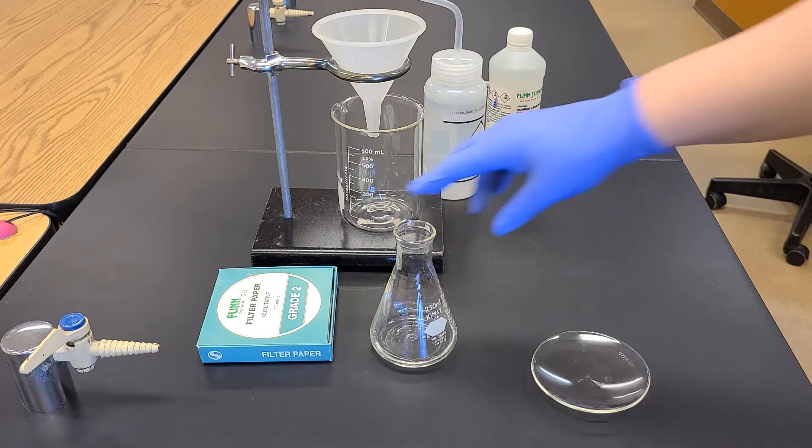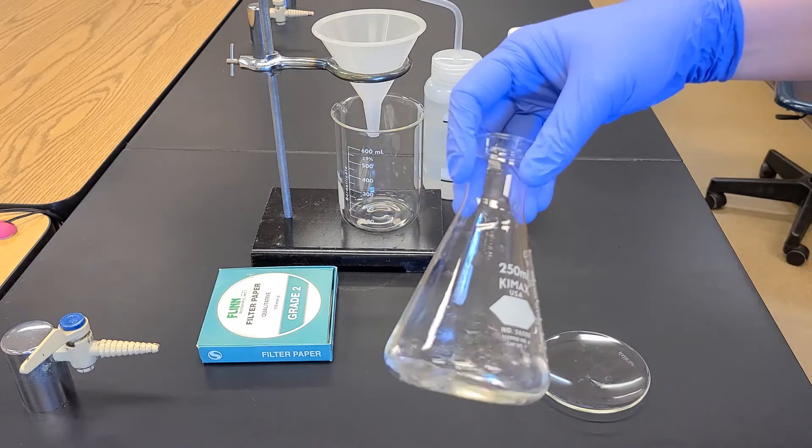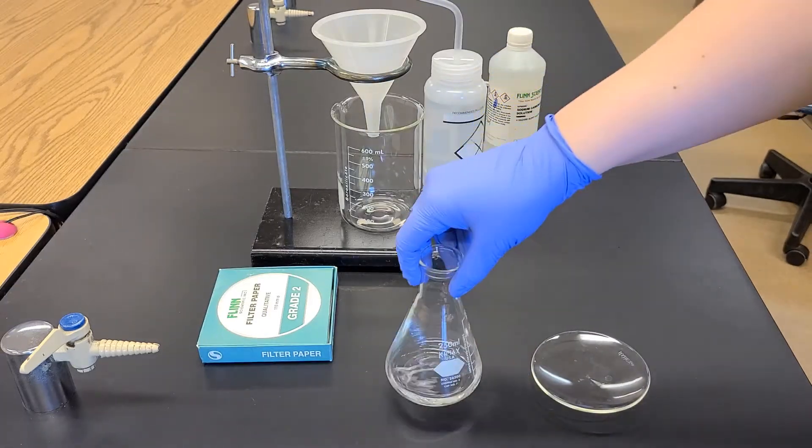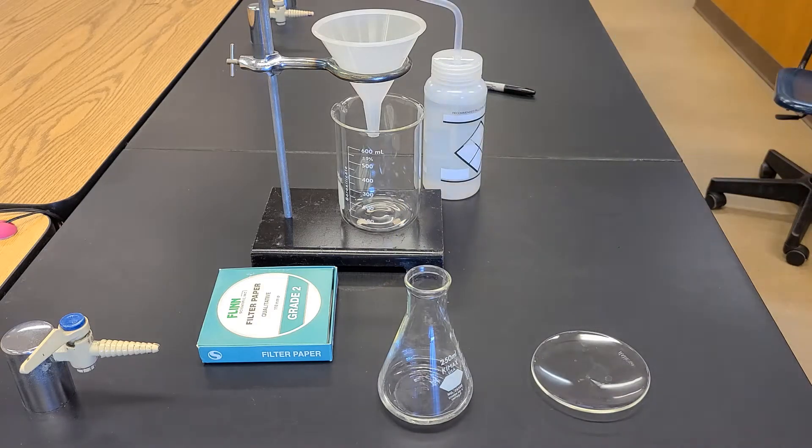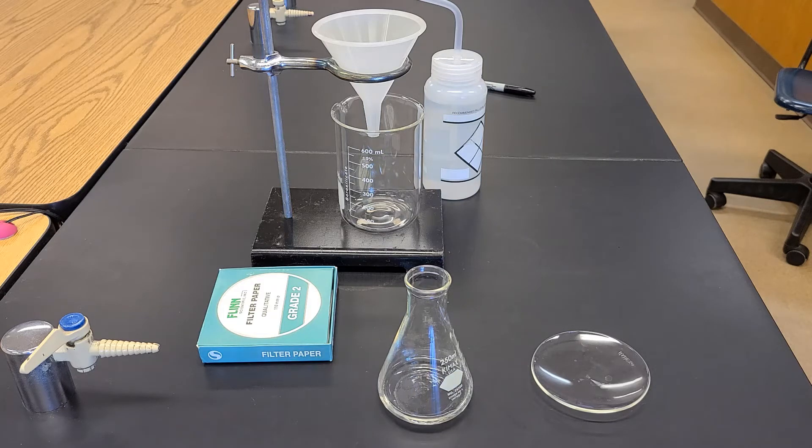Now what I need to do next is take my sample here. We can see that it looks like a clear solution, so the calcium is dissolved in the water sample, and I'm going to add some sodium carbonate to this.